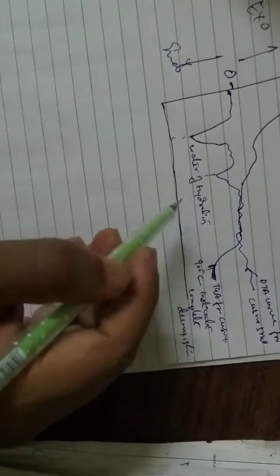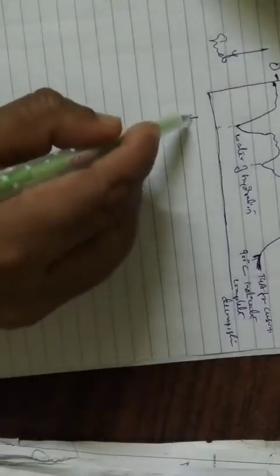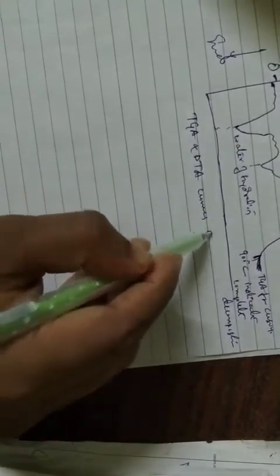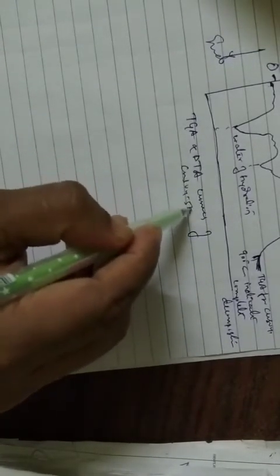So here the TGA and DTA curves of copper sulfate pentahydrate are shown, okay. So this is very much important. Here you can see both the DTA and the TGA curves shown in this figure.